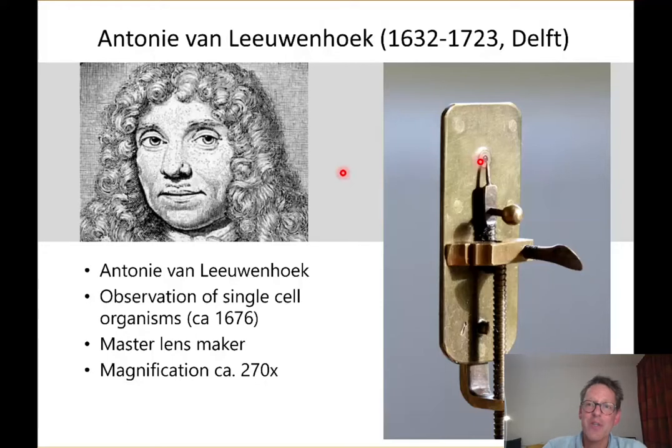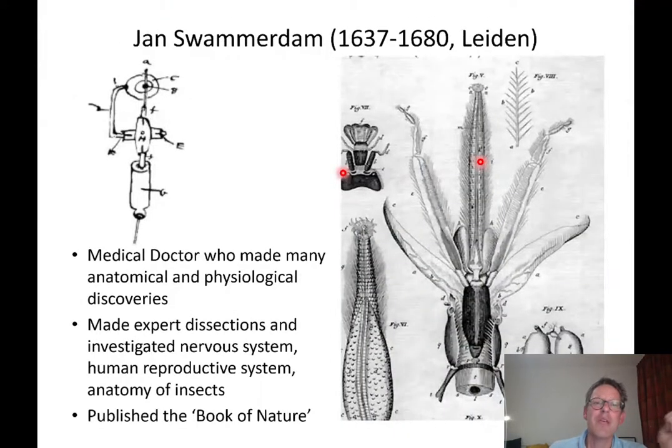And he was certainly the first person who was able, with instruments like this, to see the first living cells, the living single cell organisms at the time in pond water. And he reported this, and he called these animalcules. Nobody believed him because he was so ahead of his time. I have perhaps a story about this in a later slide. But you can see that his instrument enabled major discoveries.